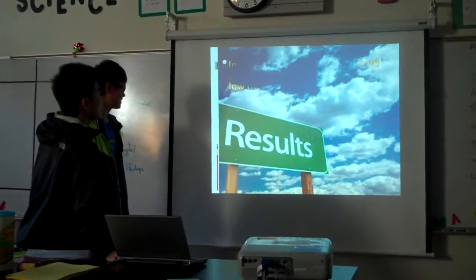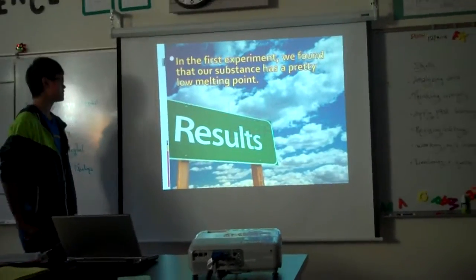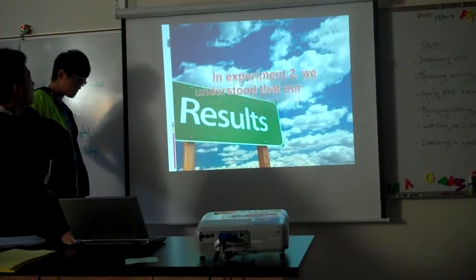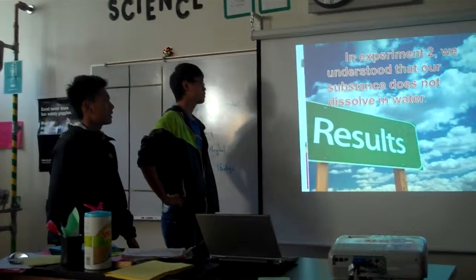So here are our results. In the first experiment, we found out that our substance has a pretty low melting point. And then in our second experiment, we understood that our substance does not dissolve in water.